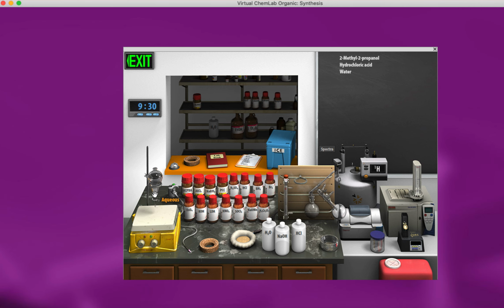So now I have my two layers. If you drag your organic layer over to the cork ring, and if you hover your mouse over it, there's nothing in it. Your product is still here in the water layer. That means your product isn't soluble in the ether solvent. And if you try to take an NMR, you can't do it because you don't have any product there.